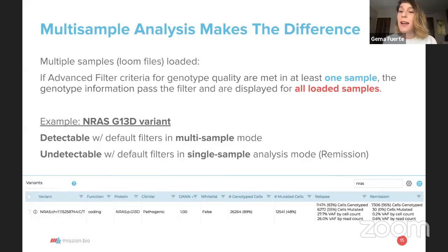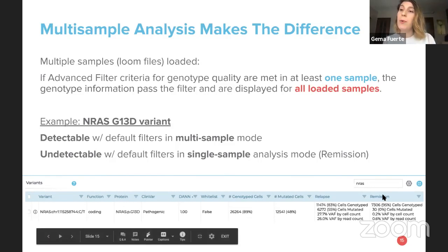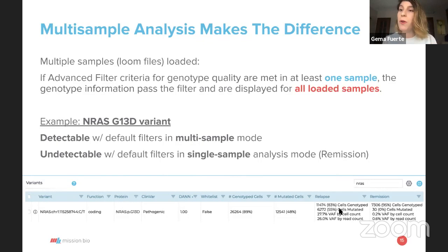Of course, you can analyze individual time points. In this case, just to close this discussion, if you wanted to analyze individual time points and you expected the NRAS, we will create a whitelist with those coordinates, lower the filter to 0.1 or 0.2, and it will show up.